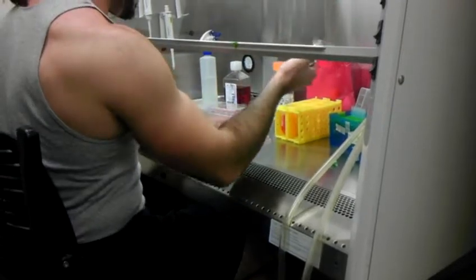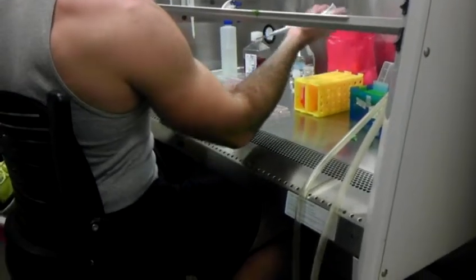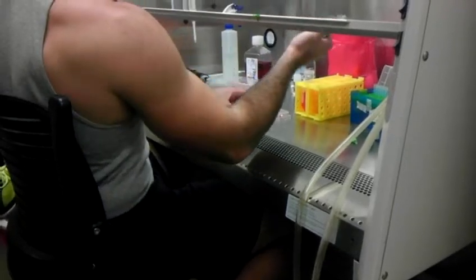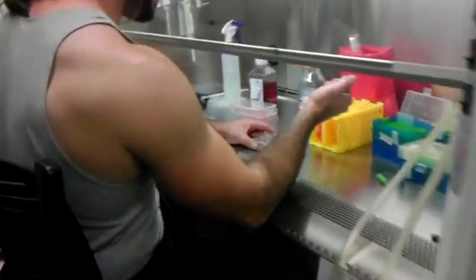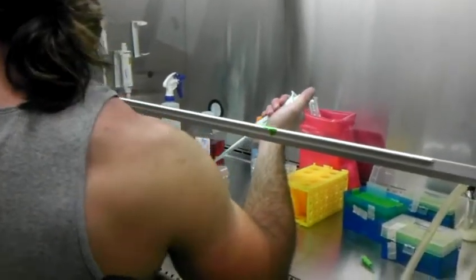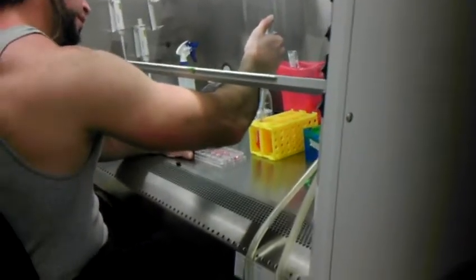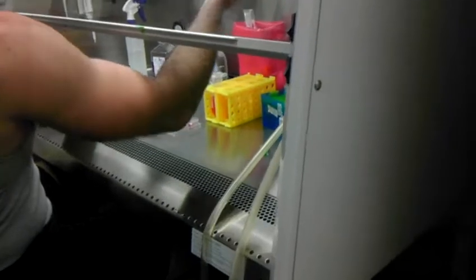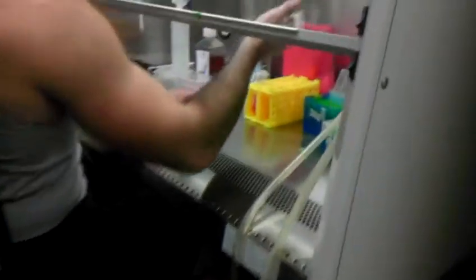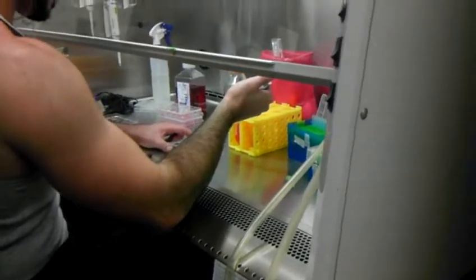I've been noticing it seems to happen quite often, and it happens again. See what I mean? Every time you pull out, there's always a little bit missing. Yeah, you're not going to get quite all of it. Part of it is the speed. Go slower as you pull out. Okay. Pull out slower. Maybe it's just when I turn it, that's what's happening. That can do it too, yeah.